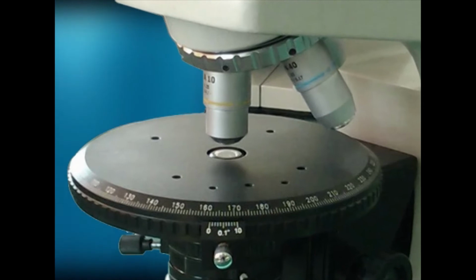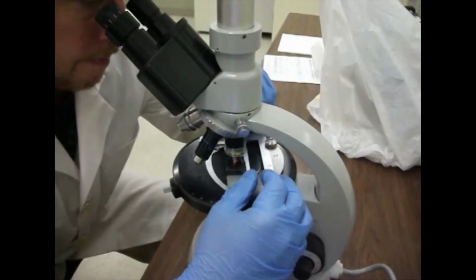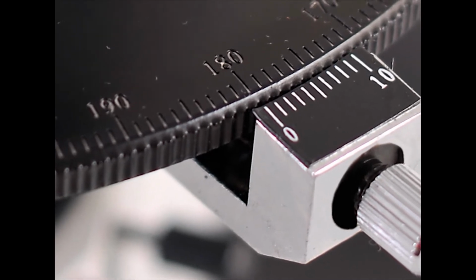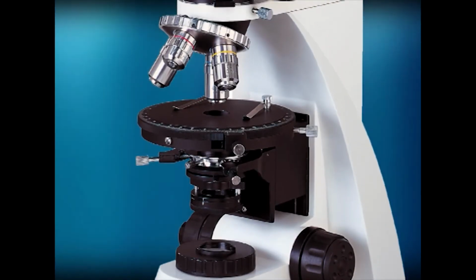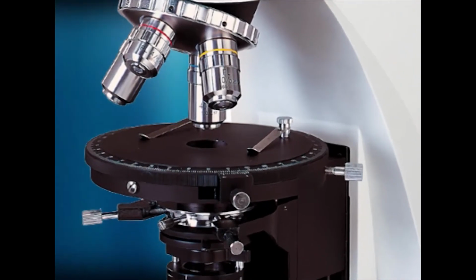The thin section of a mineral or rock is held in place on the microscope stage, usually by spring clips. It is rotatable and is graduated in degrees with a vernier attached to it. The amount of rotation of the stage can be read off directly from the graduations marked on the stage, aided by the vernier. A small knob is provided at the rim of the stage and it allows the stage to be clamped in any position.